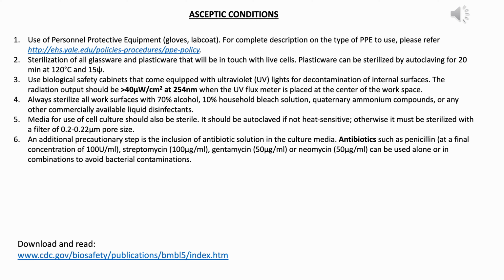And when the contaminations are very early and you don't catch it, then whatever results you're getting from your experiments will be inconsistent, because these contaminations are going to change the metabolism of your cells. And if you have not seen the contamination and you continue to do RNA isolation or protein or whatever experiments you're doing, then the results will not be as expected or cannot be trusted to begin with. So therefore, it is very essential to maintain sterility of all the objects that you're going to put inside the biosafety cabinet.